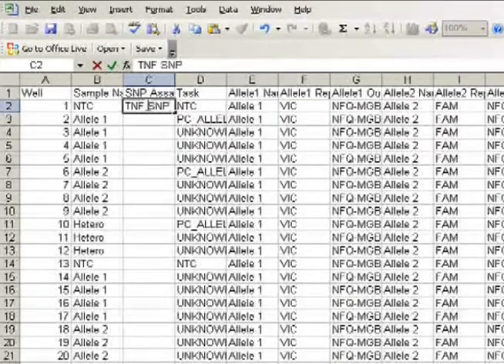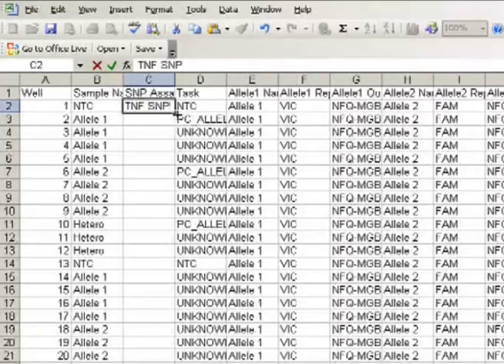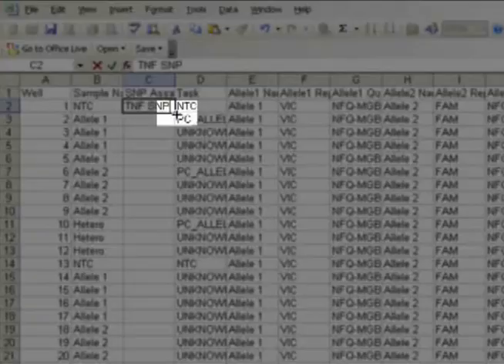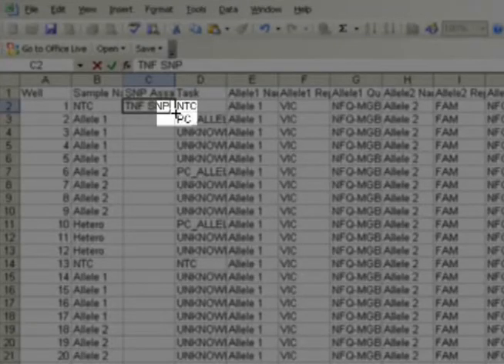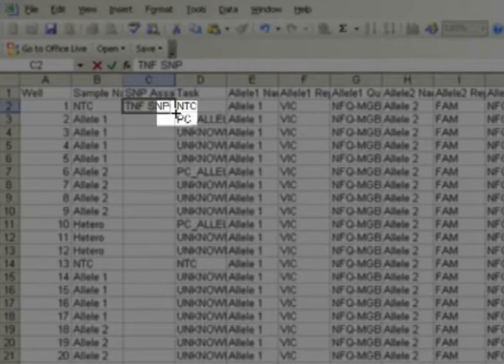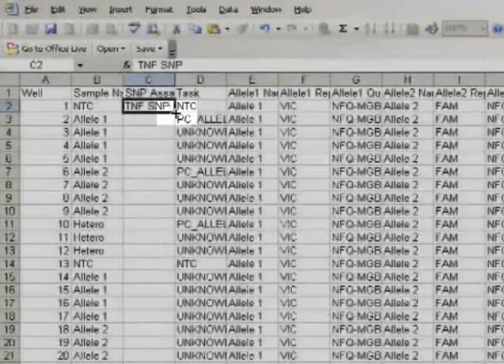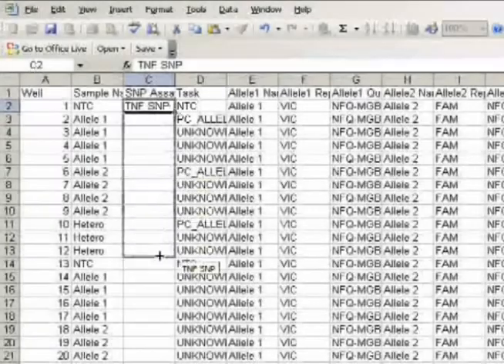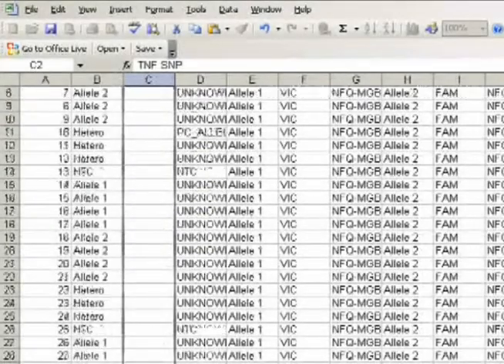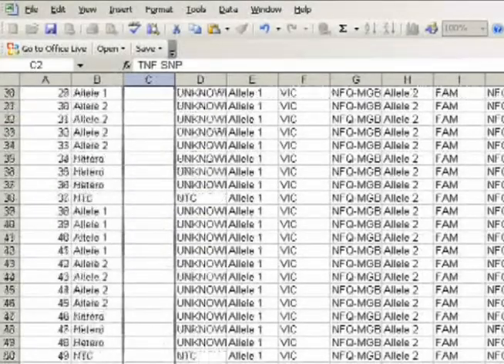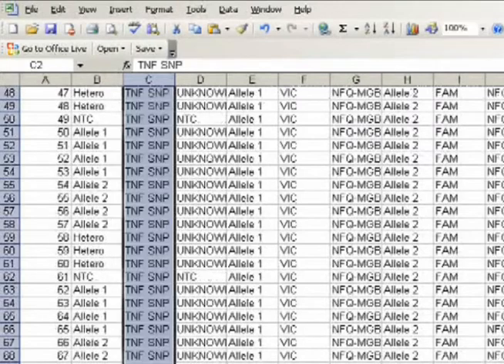Well, I can enter that assay name into this first cell, and then I drag my crosshairs over to the bottom right until I see the plus sign, and I do a drag down in order to autofill.